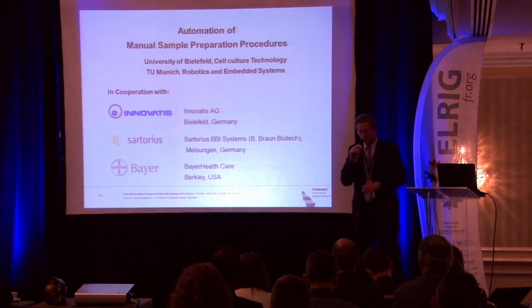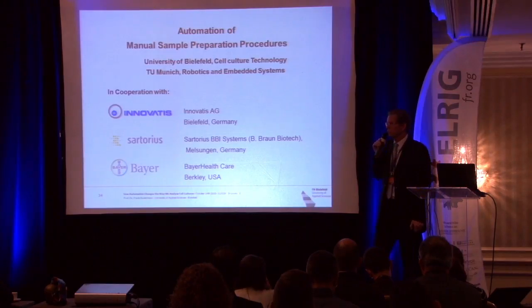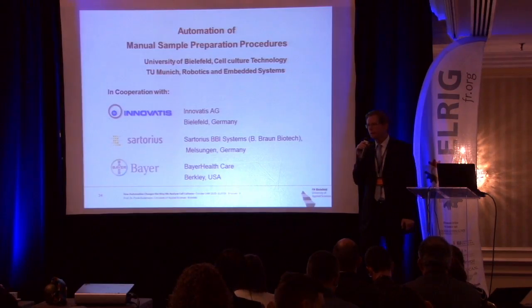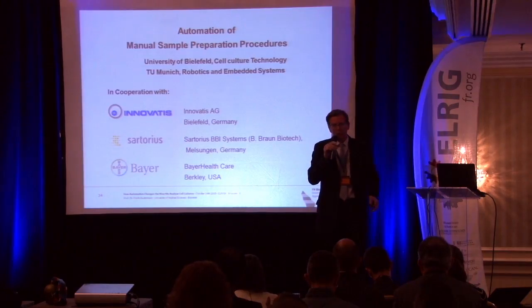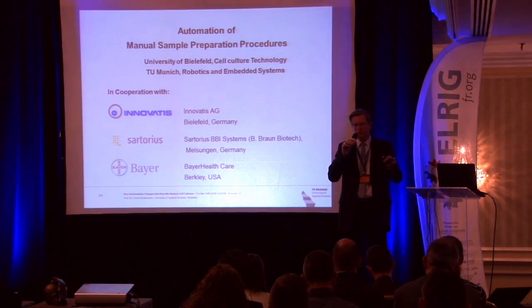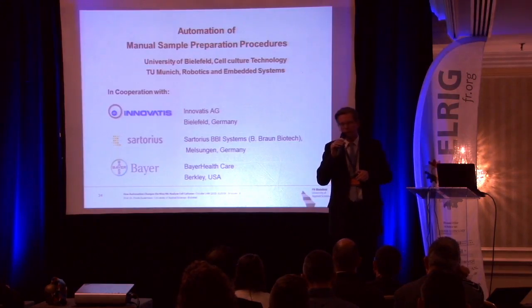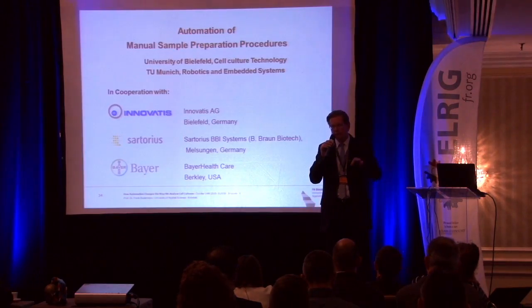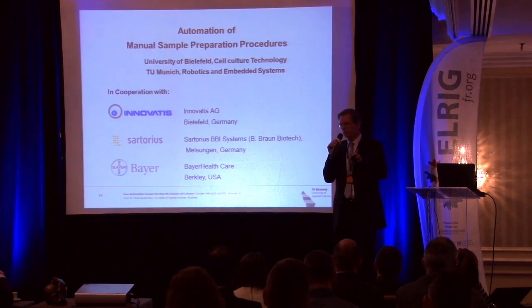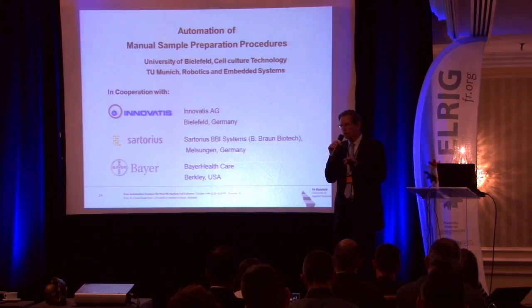And now, and that's my last point here, I want to move to something completely different, where we tried at the University of Bielefeld to use a robotic system that does not need a special space. So if we see also here pipetters, they are in a little hood due to sterility reasons. We may see robots working also in a cabinet. But that is also, of course, for safety reasons. And you need dedicated areas, dedicated points and positions where you have certain objects like pipettes, sample cups, liquids, the cell culture or whatever. And they have to be very, very precisely determined.